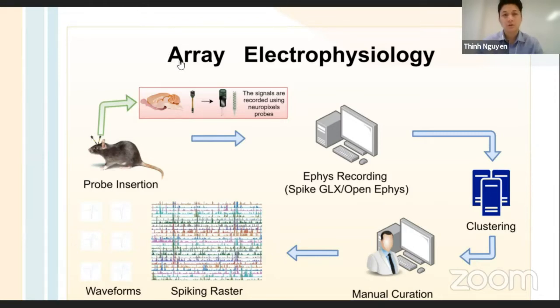In our workflow array ephys, we support Neuropixels probes. Neuropixels probes have been the focus of the field in the past several years. They are a great engineering effort where you can now record from hundreds of channels on a single probe.